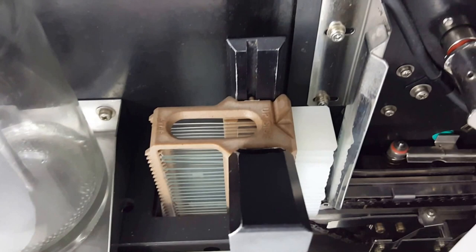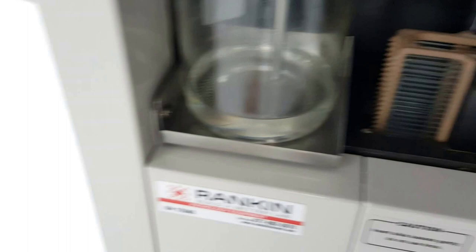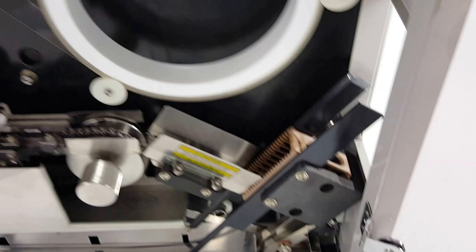A short note on the baskets — I have one basket loaded up already. On the top side of the basket you see the 'upside' writing, so you want to make sure that the slides are loaded properly with the specimen facing up. Here's the xylene bottle — we just have a little bit of xylene in there.